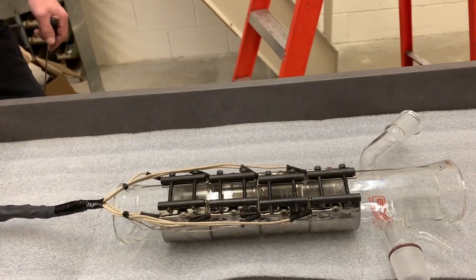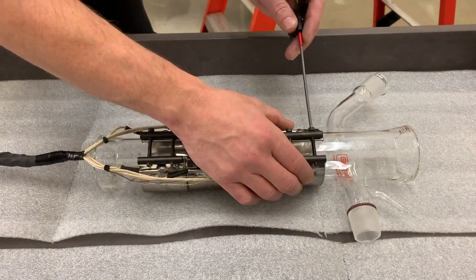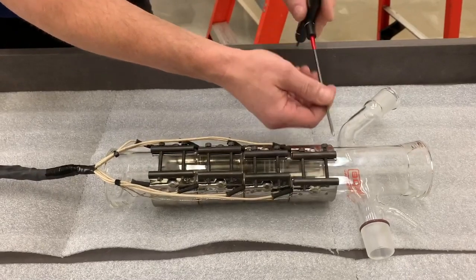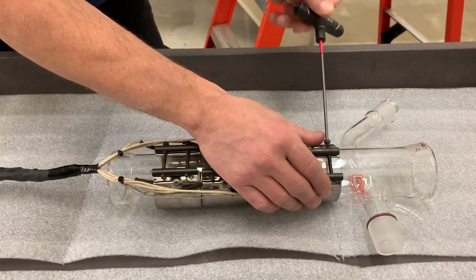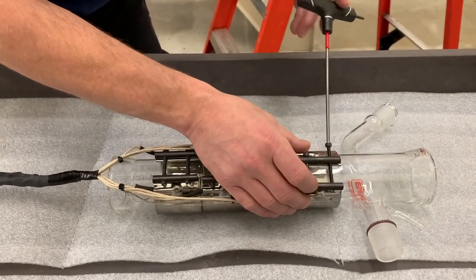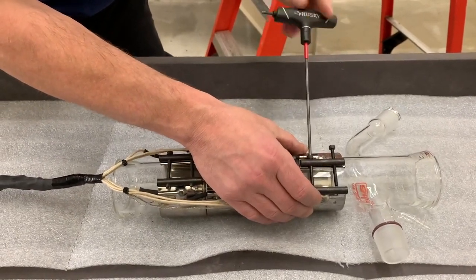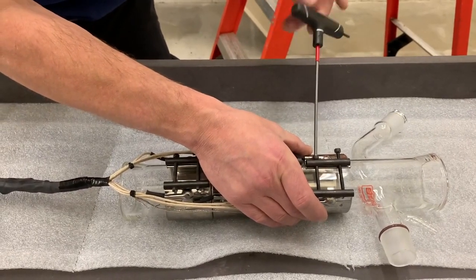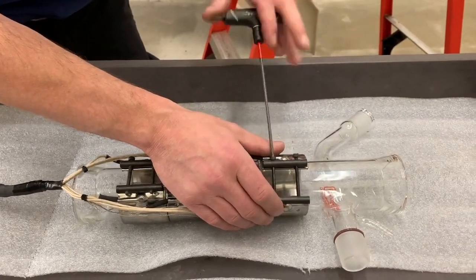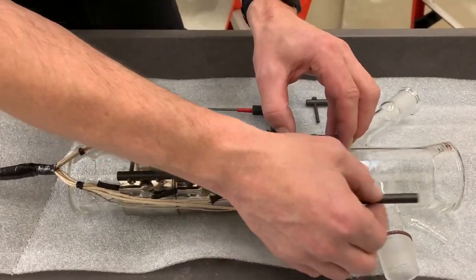So when we take these apart we need to be very careful in doing so. Dave is now going to remove one of the metal band heaters. He's going to take a three millimeter Allen key and start unscrewing the fitting. Once the screws are out, he's going to take off the necessary components.